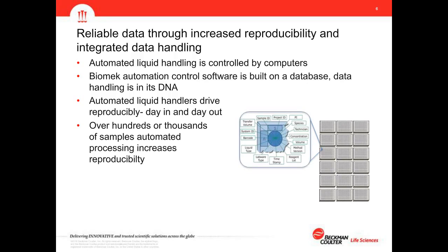On top of that, automated liquid handlers also drive reproducibility day in and day out. They are a machine, right? They do not have a bad Monday after an exciting weekend or anything like that. They can work overnight.